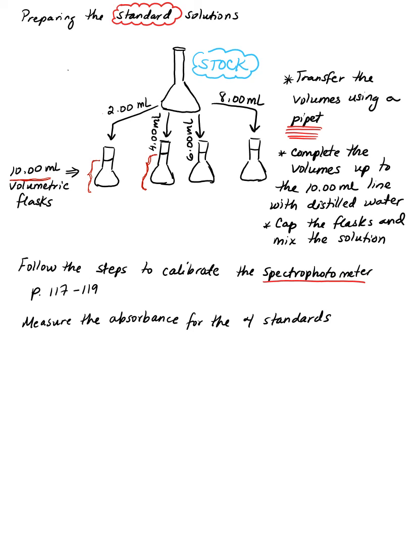Once you have the values of the absorbance for your standards, you're copying your numbers in your lab report. So your experimental data first is the grams that you're weighing of the copper acetate to prepare your stock solution. That's the number one data point that you're collecting. You have to copy exactly the amount that you're weighing. You're calculating an amount, but when you go to the mass balance, you might have something close to that number, not exactly that number. So you need to copy exactly how much you're using. So that's your first experimental point for this lab.